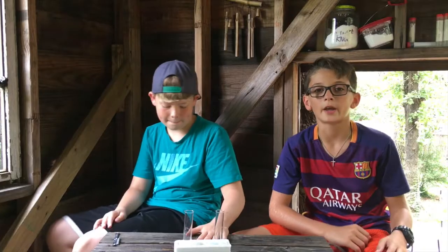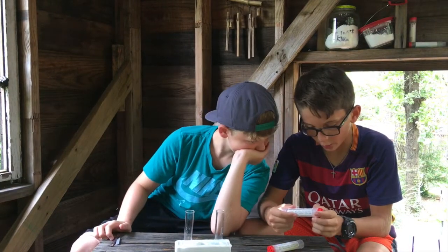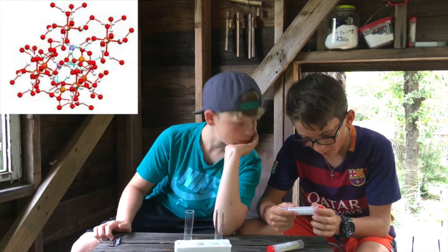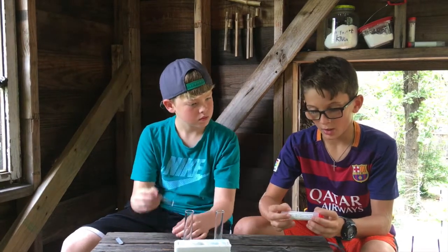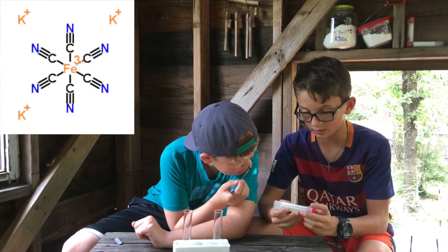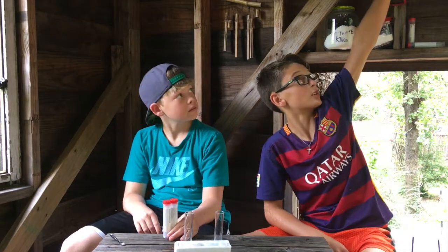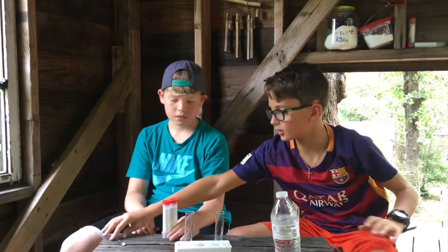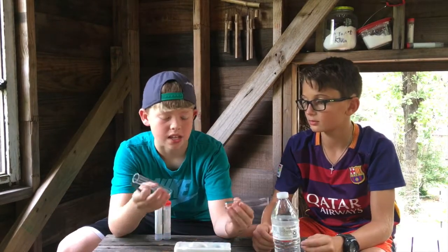Let's get on with our experiment. First we're going to need two chemicals: ammonium iron sulfate and potassium hexacyanoferrate. We also need some water, a spoon, and two test tubes or cups — glasses, whatever you have.